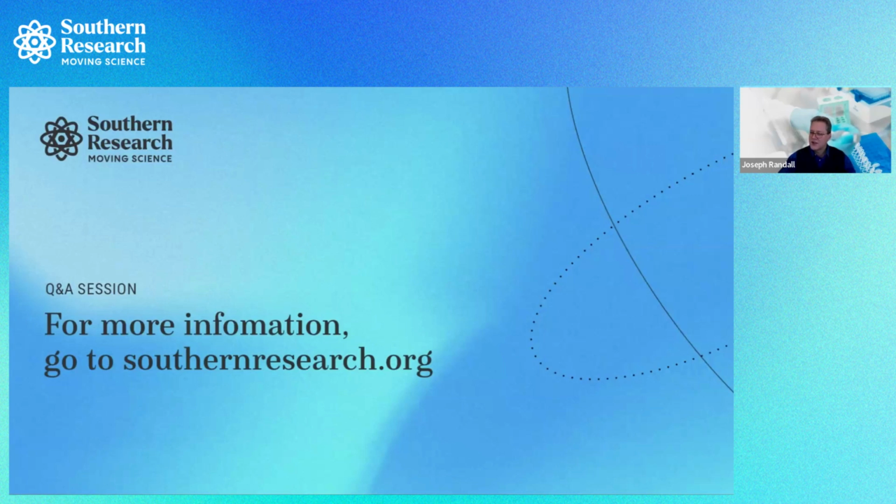So one of the other questions is, in the monkey neurovirulence test, are the brain regions examined as a coronal section or separate sections for the left and right areas? In the standard monkey neurovirulence test, I think the coronal sections were used, and we didn't specifically section the left and right hemispheres. We just used our standard operating procedures for brain sections, but for the purposes of the European Pharmacopoeia study, we did score the left and right hemispheres separately.